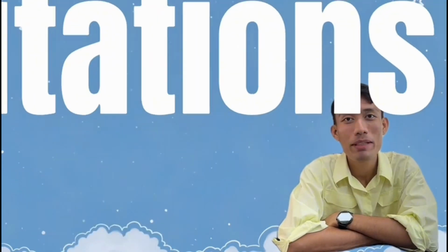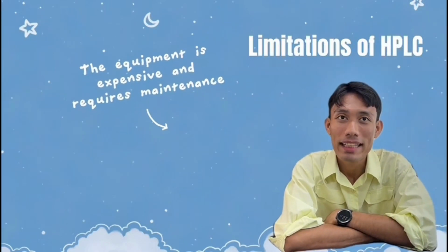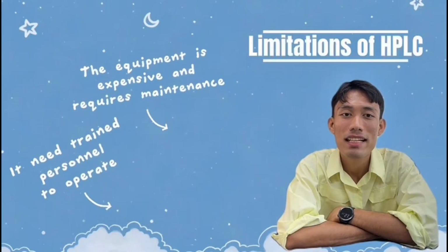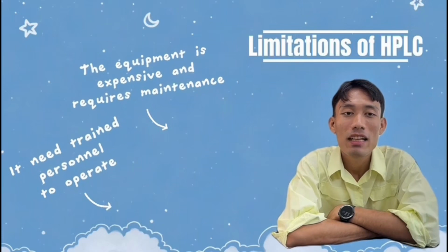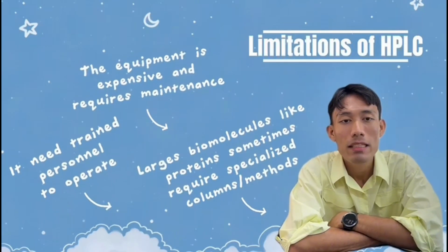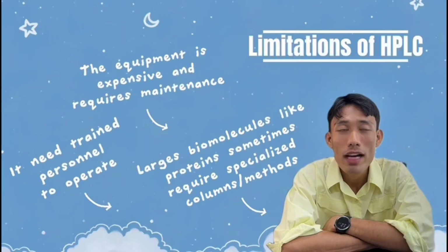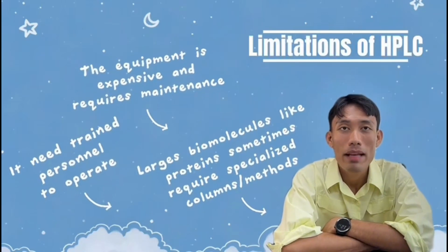And for the limitations of HPLC, the equipment is expensive and requires maintenance. Second, it needs trained personnel to operate, and also larger biomolecules like proteins sometimes require a specialized column or method. Despite these limitations, HPLC remains one of the most trusted methods in analytical labs.